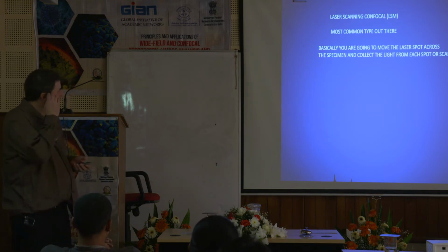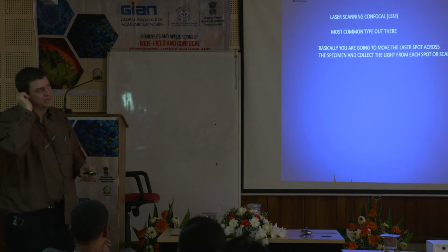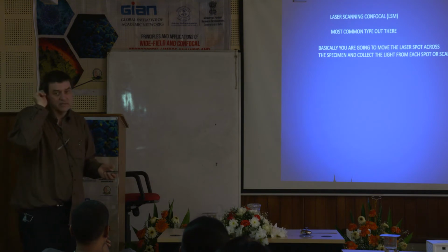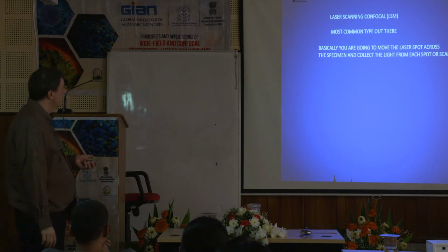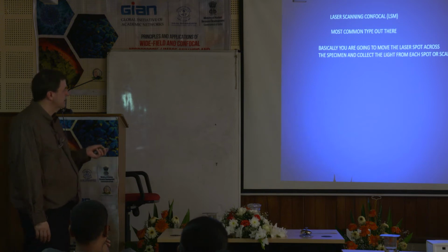Okay, laser scanning, this is the most common type you see out there. Most of the times when you go to an institution, they got a confocal, they say yes, it's probably some variety of a laser scanning confocal. Okay, so basically what you're going to do is you're going to move a laser spot across the specimen, collect the light from each spot or scan.